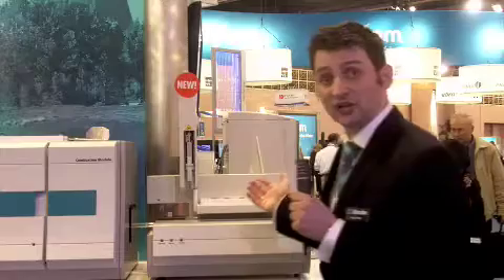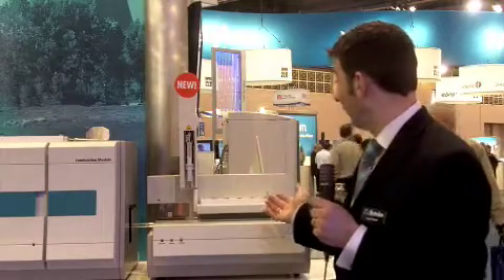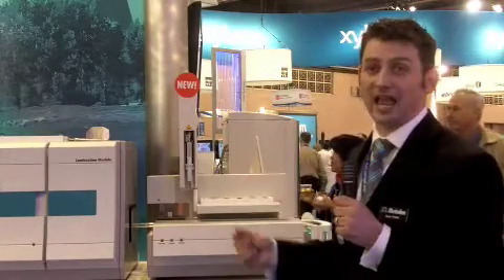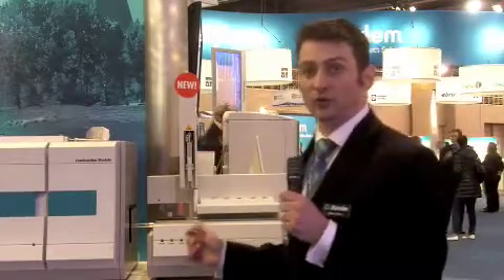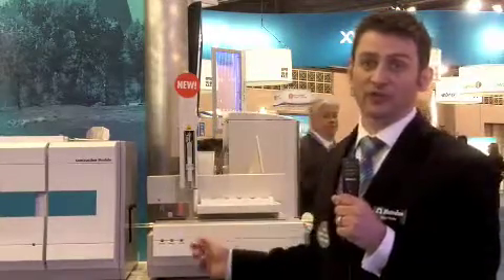I'll just talk a bit about how the system works. This is the actual auto sampler. We have the ability to run both liquids and solids from the same sample processor. That's a development unique to METROM — you do not need a separate sample processor for liquids and solids.